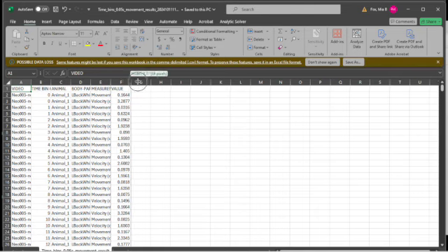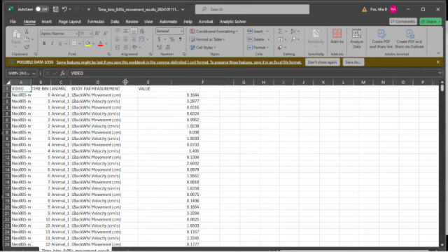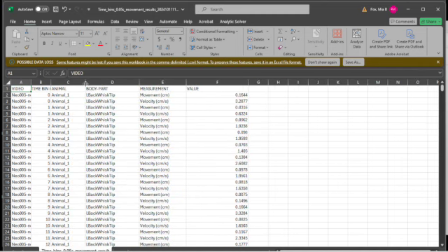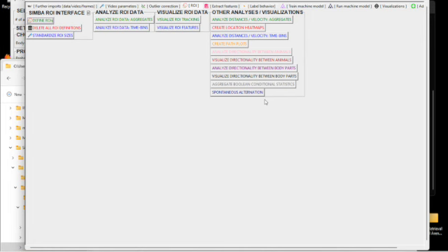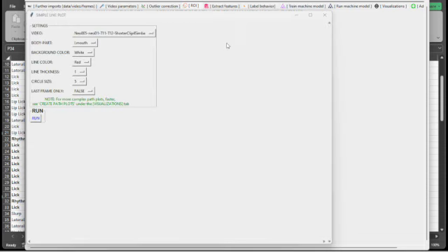Okay, so this gives me the amount of movement and the velocity of the whisker left back whisk tip for each time bin. And you can do that for the other ROI data as well in terms of getting it into time bins. I can create a path plot as well.